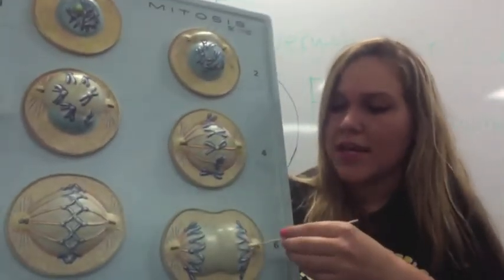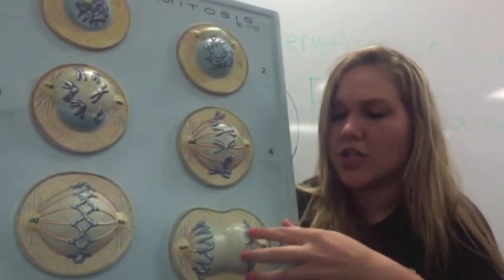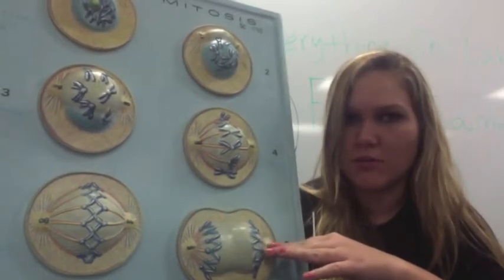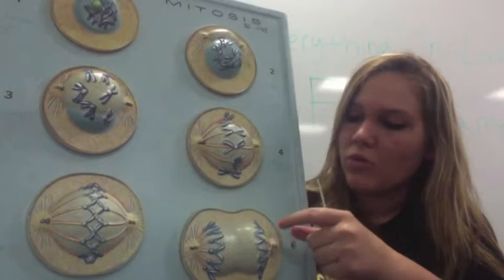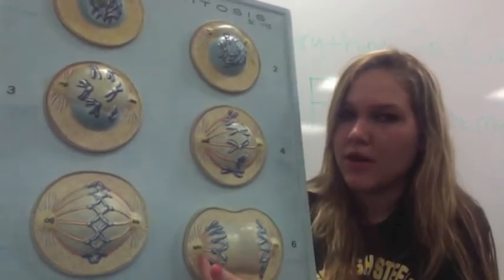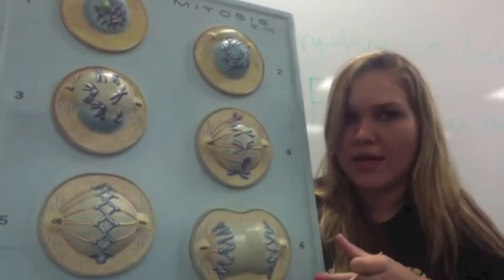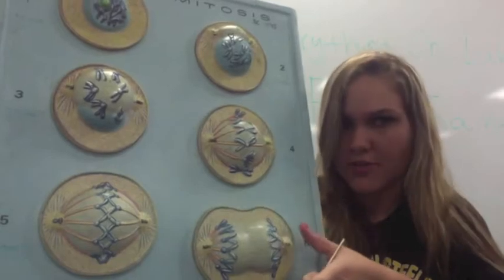Here is anaphase. Anaphase is when the spindle fibers are starting to actually pull the chromosomes apart, and at this point, they're not called chromosomes anymore. They're called sister chromatids because you have one pair on this side and one pair on the other side. So this is anaphase, and the way you can remember, anaphase is away. The spindle fibers are pulling the sister chromatids away from each other, so anaphase away.